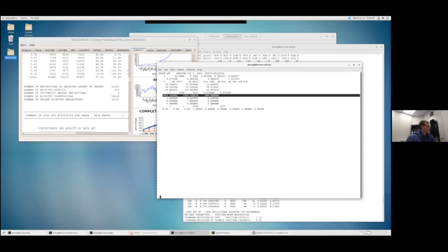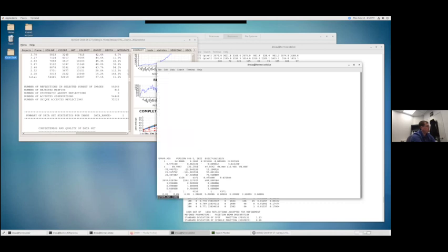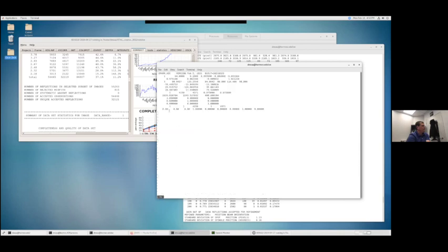One thing you can do is once I've run XDS, it then produces this file called gxparm. It's exactly the same format, but these are now the refined values. So you can see for the space group and unit cell, rather than having a space group number of 1, it has a space group number of 3. And then it has the unit cell values that it came up with, right? And it also has an update on the beam position, the direct beam position.